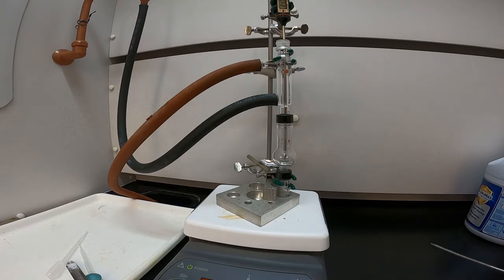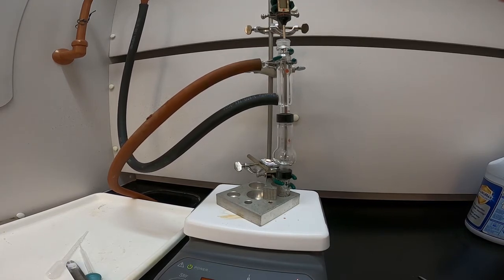So as this proceeds and we start to collect some of the liquid, some of the vapor as it rises will condense on the tip of the thermometer, and that's how we can collect a boiling point of our product. I'll come back in a few minutes once we start collecting some liquid and show you how the temperature of the thermometer in the middle there has changed to measure the temperature of the vapors condensing, which corresponds to the boiling point.